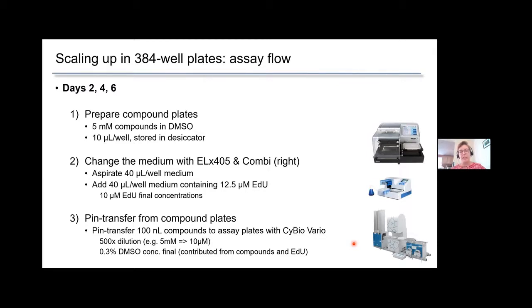Many screening facilities also use acoustic transfer, where you can take your plate containing DMSO, where each compound is dissolved in DMSO, and use an acoustic wave to transfer nanoliters of compound to your well containing cells. We have not really explored that very much, to be honest. So right now all of our steps are optimized to the plate-based and pin-based transfer.